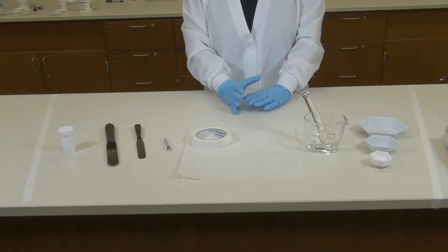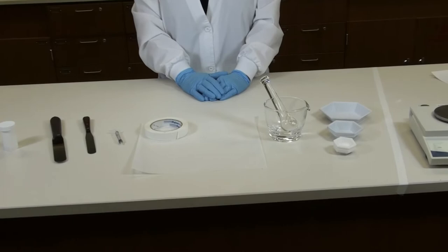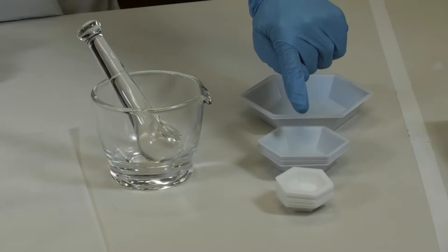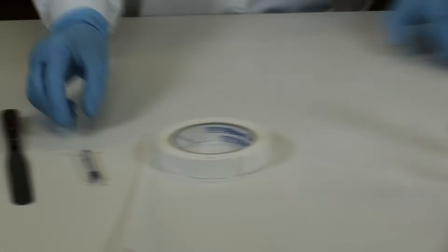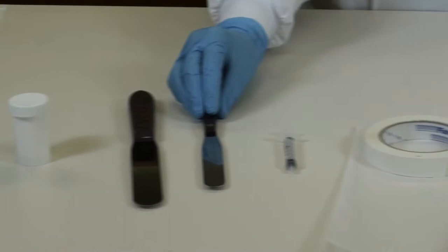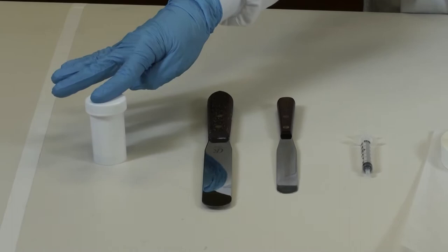Gathered here are the supplies for the wet lab cream we will be compounding. We will need large, medium, and small weigh boats, your glass mortar and pestle, some ointment paper and tape to tape it to the counter, a 3 ml slip tip syringe, and small and large spatulas, and finally an ointment jar, 1 ounce.